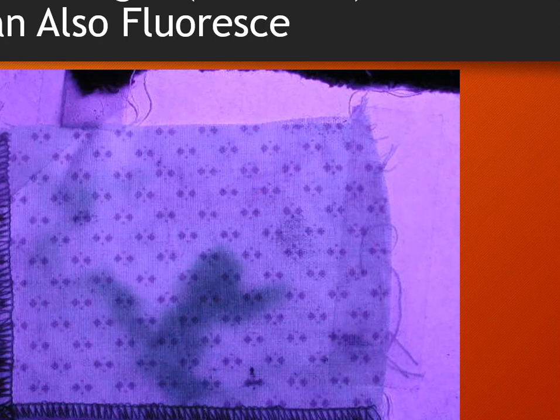Now, what I've just done is that I have taken the white light and I have changed it a little bit. No longer is it white light anymore. So it looks like I don't really see anything new, right? I still see the stain, and that stain is still about right here. And look, I was correct. That stain does look like it continues on over onto this piece of fabric, and I can continue just to outline it, and there we go.